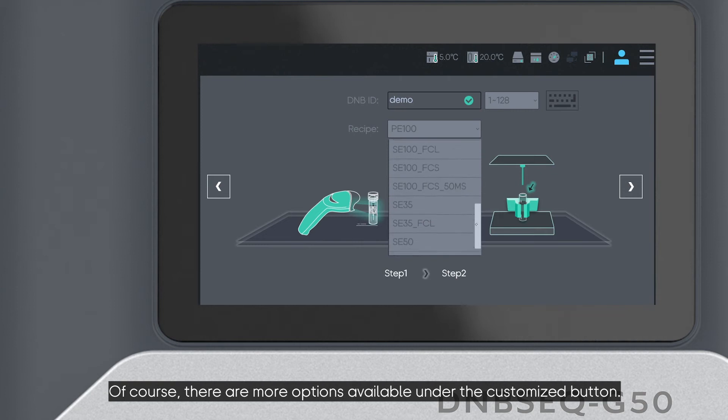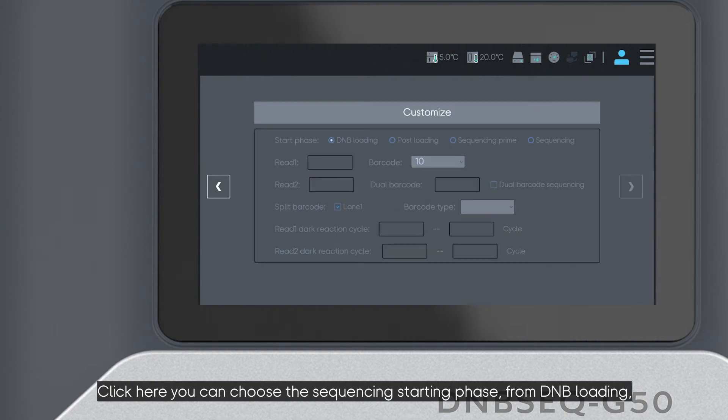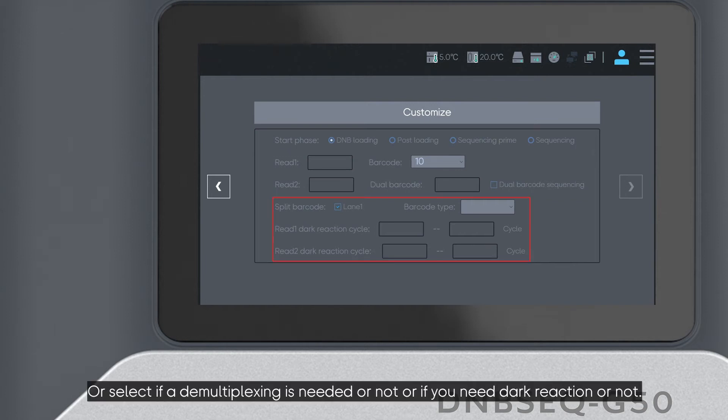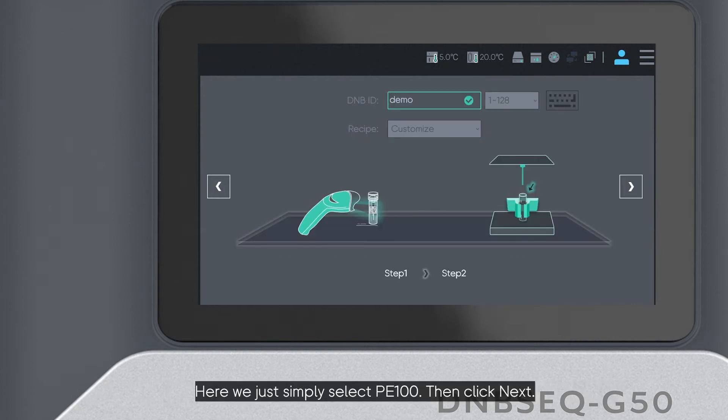There are more options available under the Customize button. You can choose the sequencing start phase from DNB loading, post loading, sequencing prime, or sequencing. If you have prepared samples with dual barcode, you can also type in your dual barcode length, select whether demultiplexing is needed, or whether you need a dark cycle reaction. Here we simply select PE100.